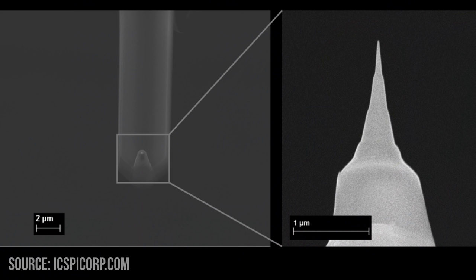Those images were taken on an atomic force microscope, and that's the topic of the video today — AFM. It's a member of the scanning probe microscope family, where you physically take a probe and scan it across the surface of your substrate, and that's what gives you the topographic information. This differs from a confocal microscope in that we're physically touching the surface rather than sending down a stream of photons. It's not uncommon for AFM probes to be on the order of 20 to 100 nanometers, which is considerably smaller than even ultraviolet light.